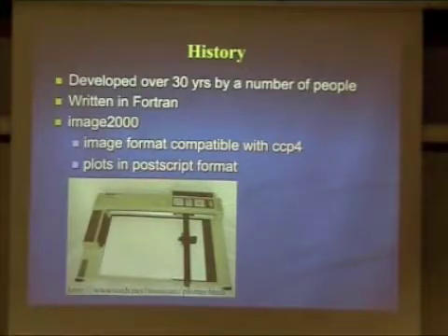So the program is mainly written in Fortran, and the last time it had a major general update was in 2000, when they changed the image format so that it's compatible with the crystallography package CCP4. And at the same time, they changed the plots generated from the programs into the modern PostScript format.